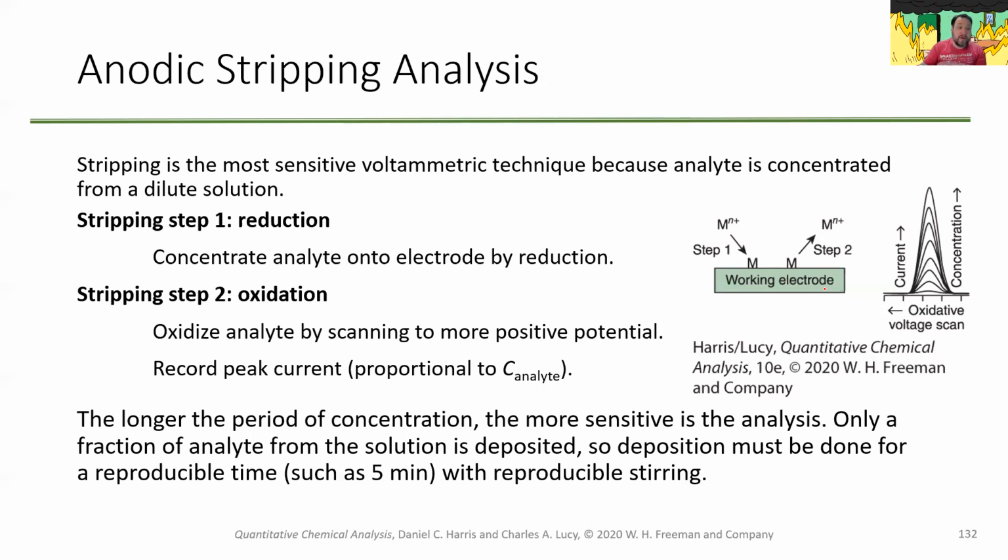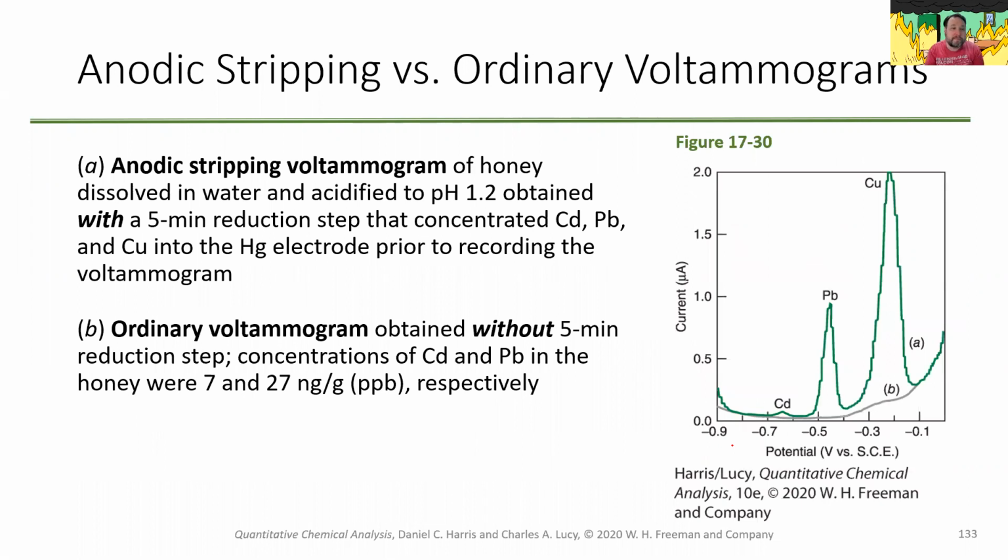So the longer the period of concentration, the more sensitive your analysis is, right? So if you just let that sit there for like a couple of hours, you're going to probably capture all of the stuff in solution. Okay? Only a fraction of the analyte from the solution is deposited, so the deposition must be done for a reproducible time, such as 5 minutes with reproducible stirring, right? So you want to make sure that the conditions are all the same, right?